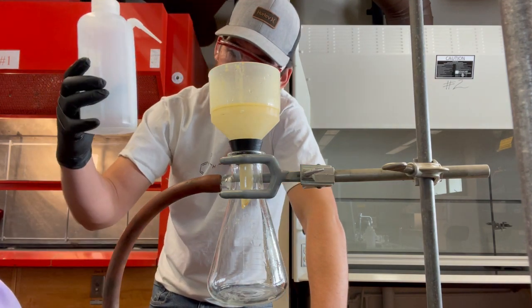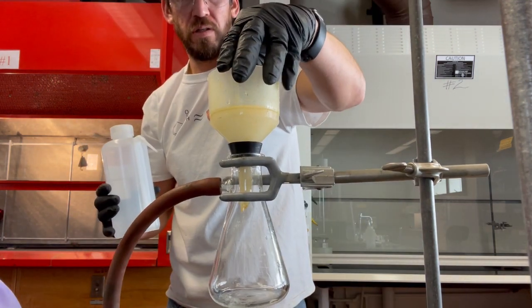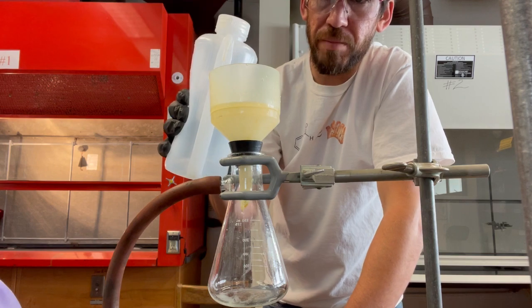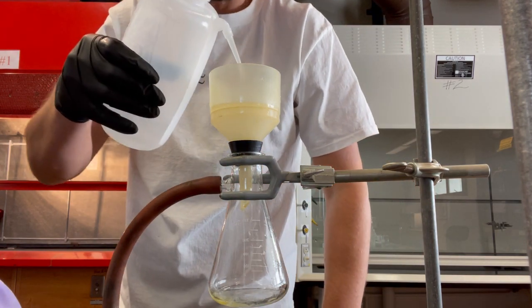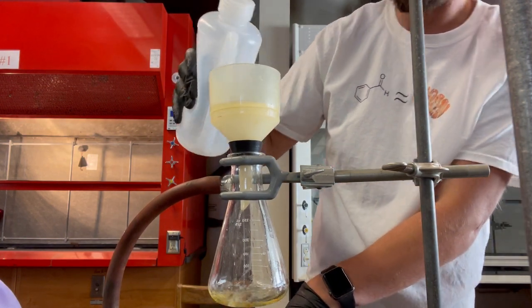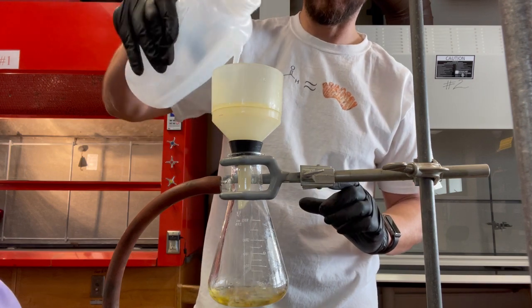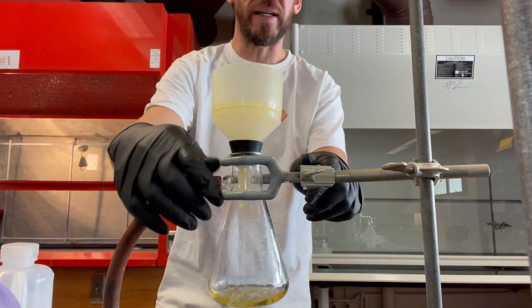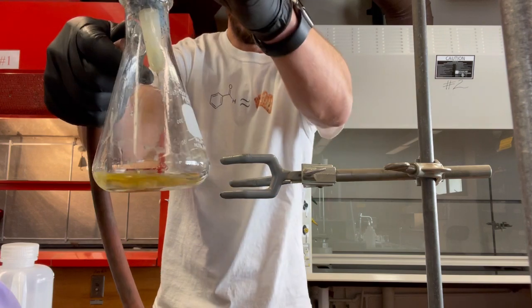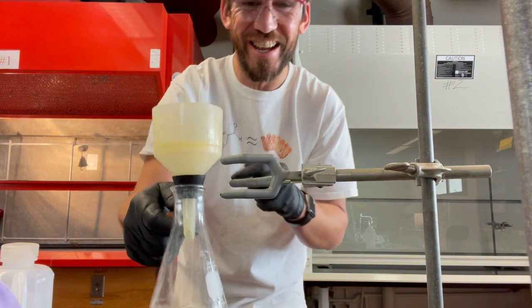Okay, so hopefully we have enough acetone in here. But let's see. So vacuum on. You may or may not be able to see that, but squeeze that on there. Yeah, we definitely got some garbage here. Hit that. Ooh, so fresh and so clean. About to be. You could probably even see the yellow. Look at that. Oh my goodness. Nasty. Look at the yellow. So as good as you are at cleaning with soap, sometimes it just doesn't do the trick. Acetone does though. Okay, good.